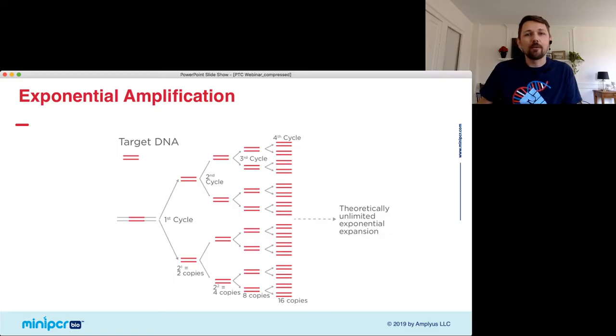So after about 30 cycles, which is what we're doing here, you should have roughly 1 billion copies of your DNA for every copy you started with. And again, that's 1 billion copies of only the very small sequence that we're interested in. In this case, in this lab, we're copying a 250 base pair sequence, just 250 base pairs of that gene. And we'll talk about why it's that little region in just a second.